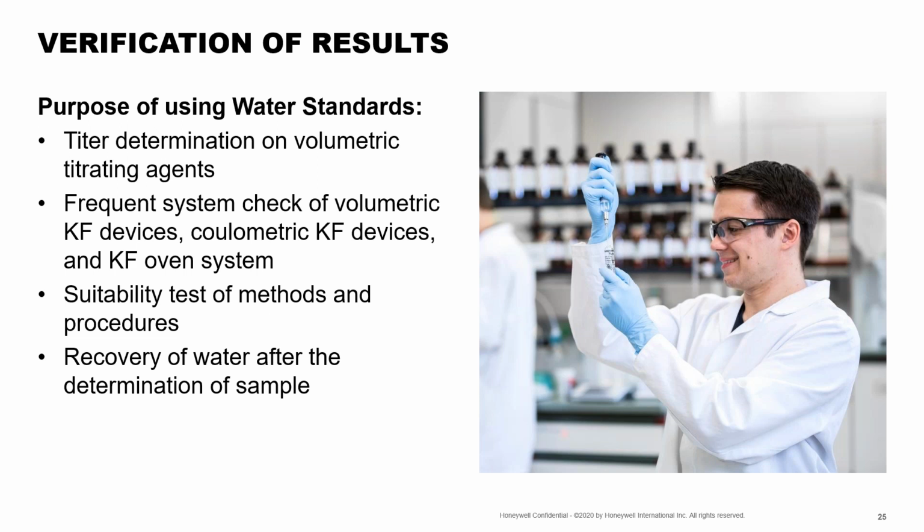The water standards, we recommend using. Some customers like to use just pure water. It's available in your lab pretty regularly. The reason that we really recommend using water standards as a best practice instead is just due to the sample size that you need to use when you're working with pure water versus the water standards themselves.